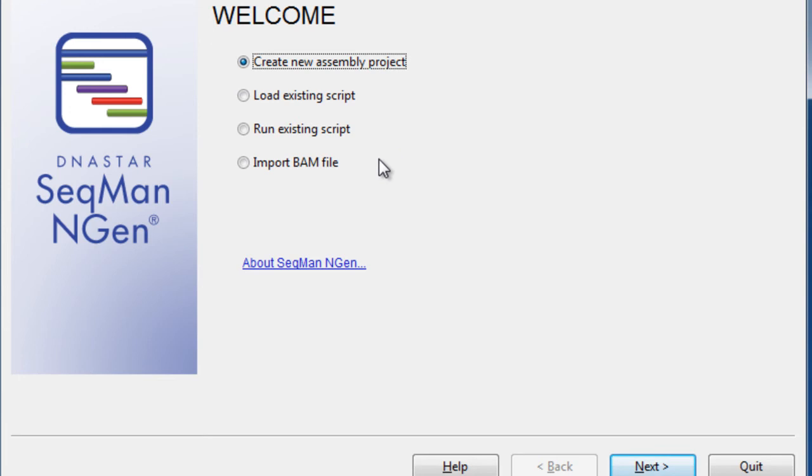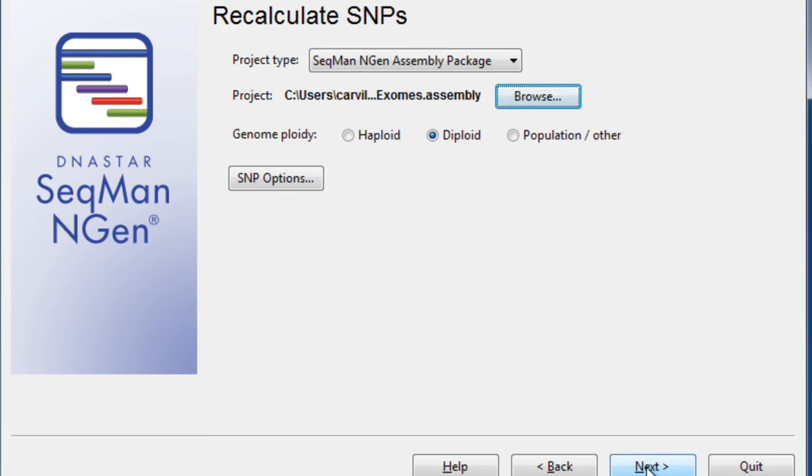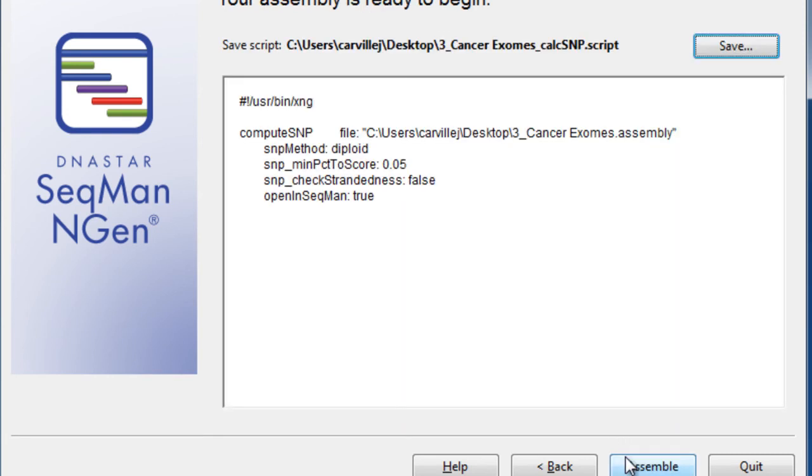First, we'll select Import BAM File, and then Recalculate SNPs. Next, we'll want to import our assembly project into the wizard, as I've already done so here. And finally, you're ready to assemble.